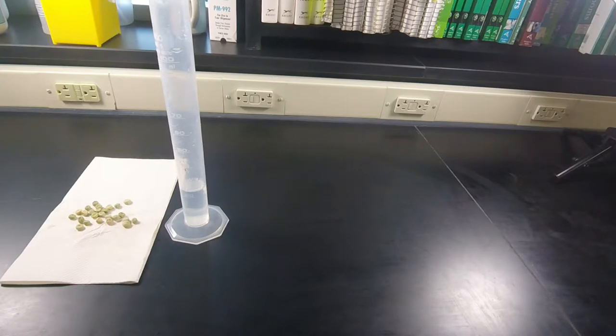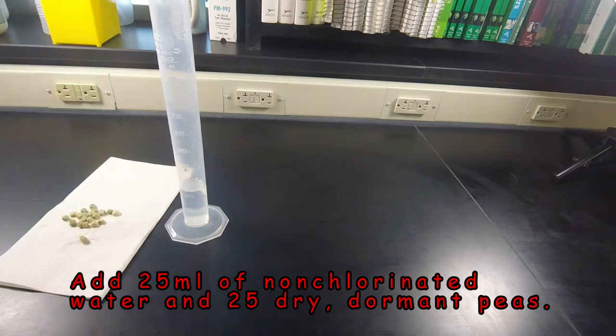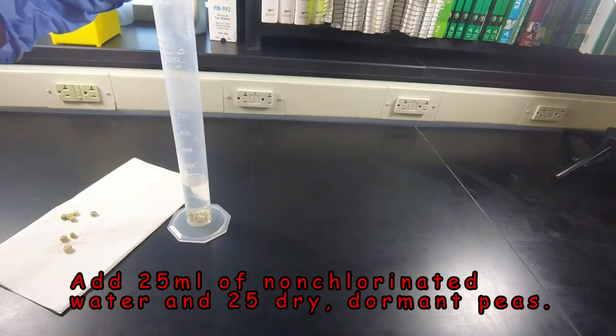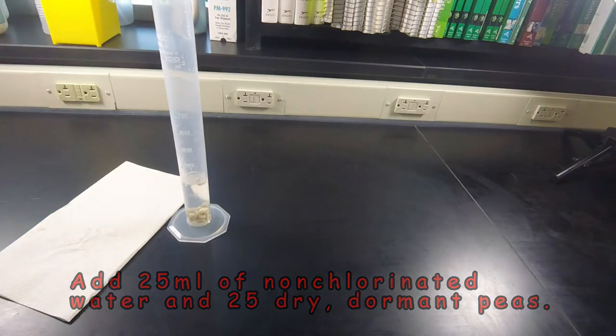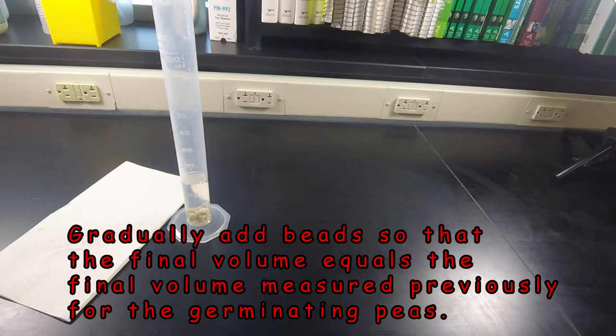After you have removed the germinating peas, refill the graduated cylinder to 25 milliliters, which I've done here, and then add 25 dormant peas to the water. Then you're going to add beads to the graduated cylinder containing the dormant peas so that the final volume is equal to the final volume measured previously for the germinating peas. Adding beads to the graduated cylinder with the smaller dormant seeds ensures that the respirometers contain equivalent volumes at the start of the experiment.